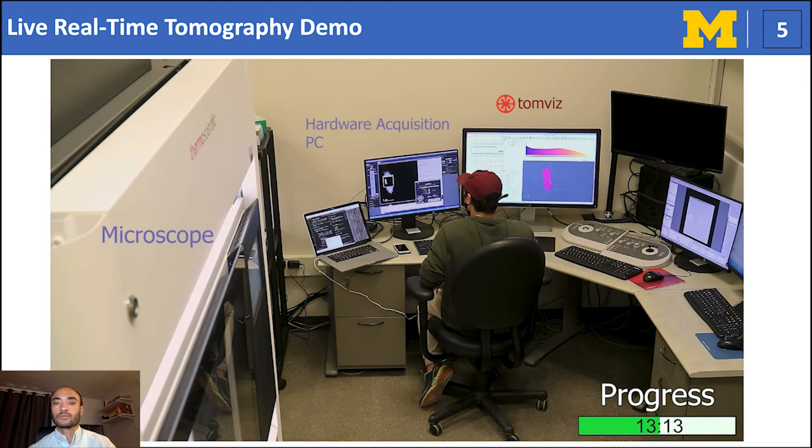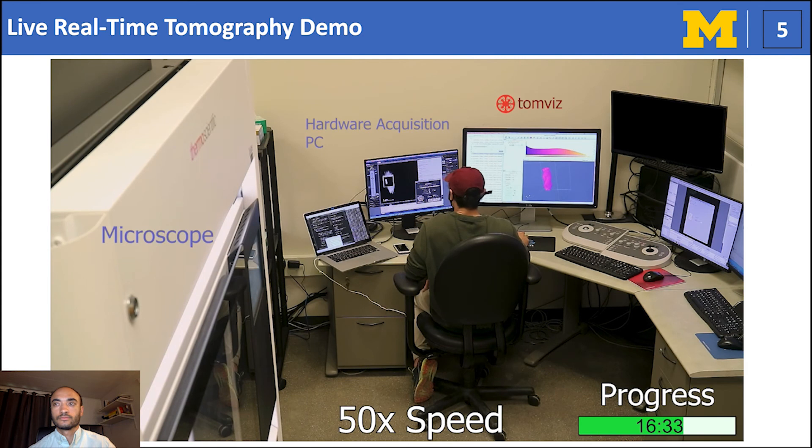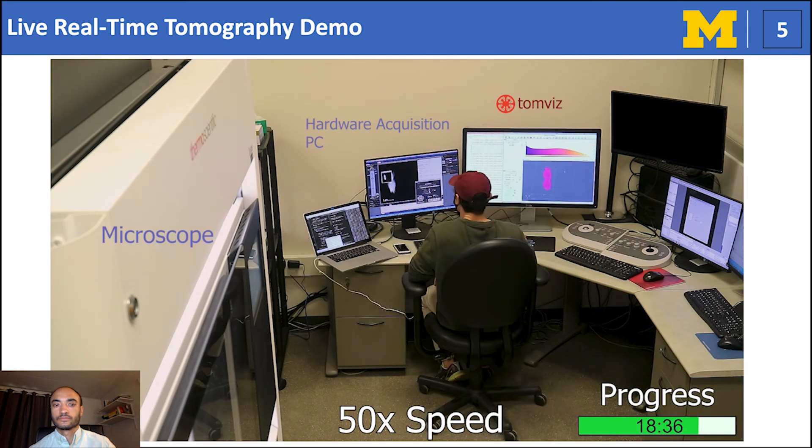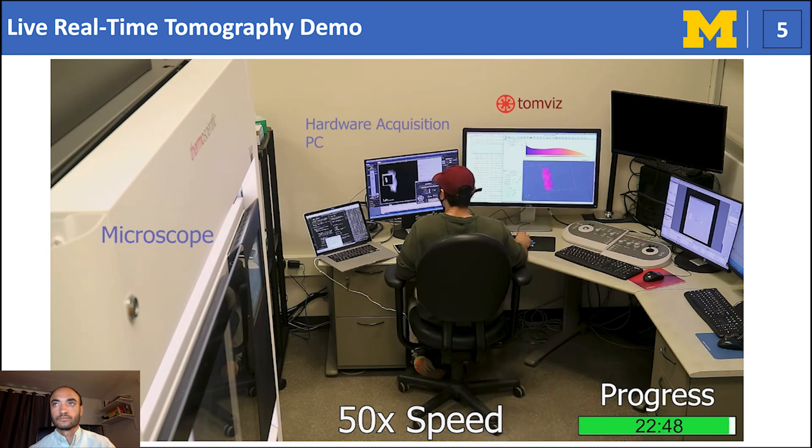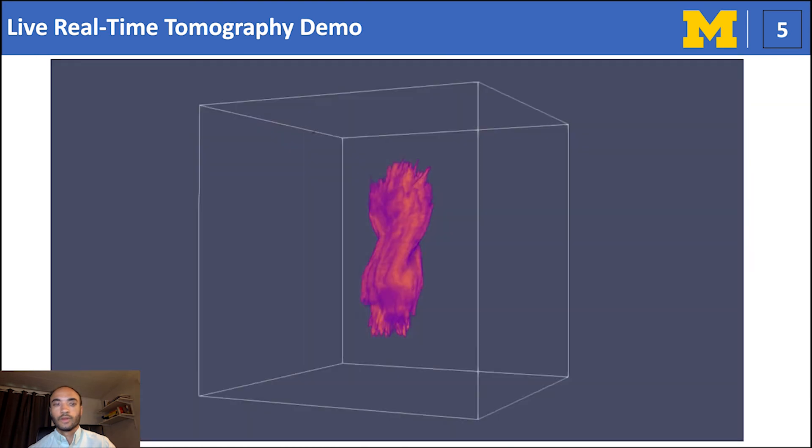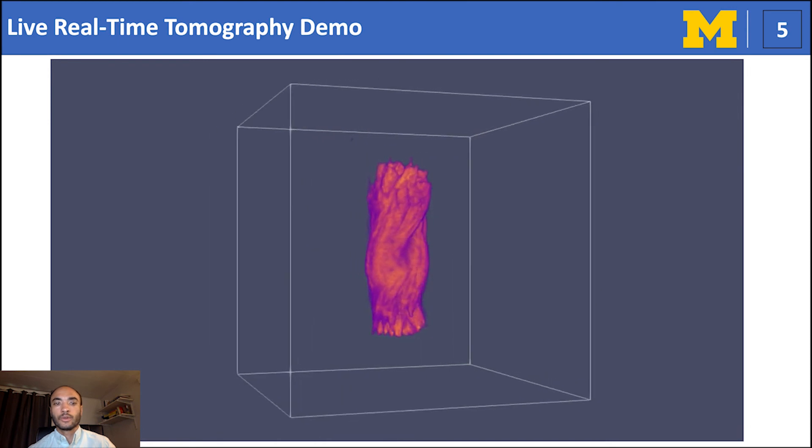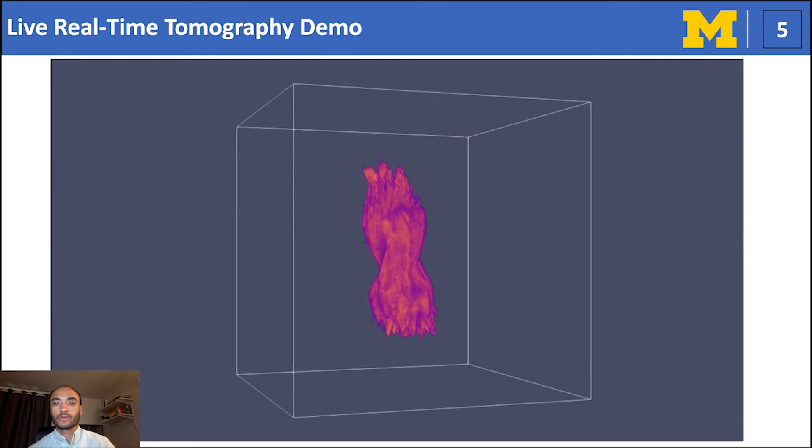Now, let's quickly collect the remainder tilts. We have a beautiful and fully constructed tomogram available for further analysis.